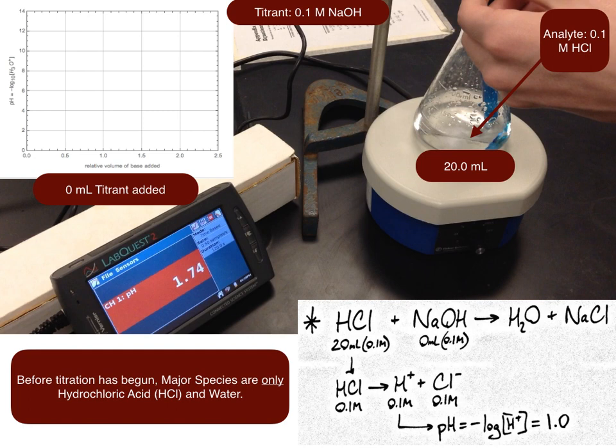In this case, the analyte is hydrochloric acid, placed here within an Erlenmeyer flask. A pH probe is also inserted into the flask to measure the pH as the titration progresses. Before the titration has begun, the pH of the analyte is only dependent upon what was initially placed into the solution, in this case, the hydrochloric acid. Some deionized water was also added to the flask to help with adequate stirring. This is why the calculation provided will be somewhat lower than the pH measured.